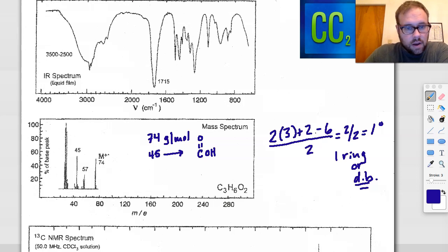That would be suggesting that we could have a carbonyl, and that would account for the degree of unsaturation. We do have two oxygens so this is possible. We also have a peak at 57. The peak at 57, one of the most common is an ethyl ketone, so it's a CH3CH2C=O fragment. This is certainly possible because if we're saying we have a carboxylic acid and an ethyl ketone portion, we could just finish this off as a carboxylic acid.